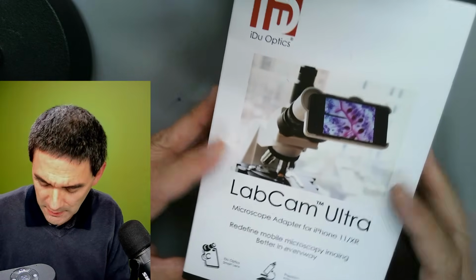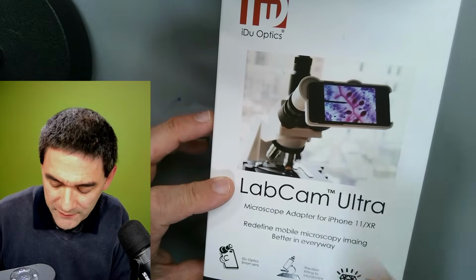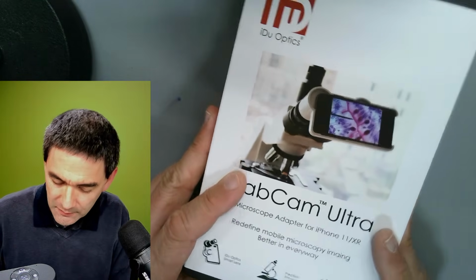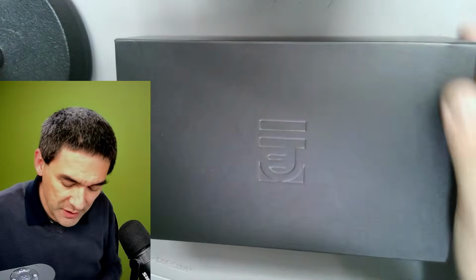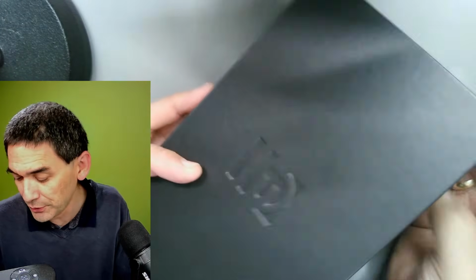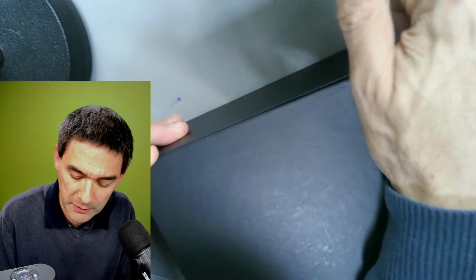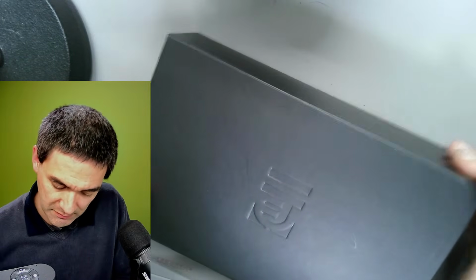It's phone specific, so I used my wife's iPhone to test this. This one is quite interesting, and the image quality is very good. Why do I talk about image quality? Because it includes optics. I was also thinking, I have a 3D printer. If I were to 3D print something, I would probably use this as a sample. Oh, magnets. So this is how it looks.